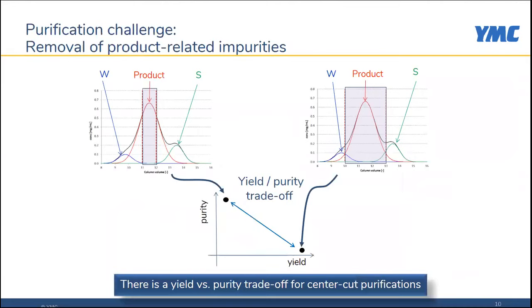So let me now start with the MCSGP process. In traditional HPLC purification, we have a problem concerning productivity. In analytical HPLC, we are striving for baseline separation, but this is not very productive and needs a lot of solvents. So to reduce the solvent needs in preparative HPLC, injections are overloaded, but then there are product-related or process-related impurities eluting with our main peak.